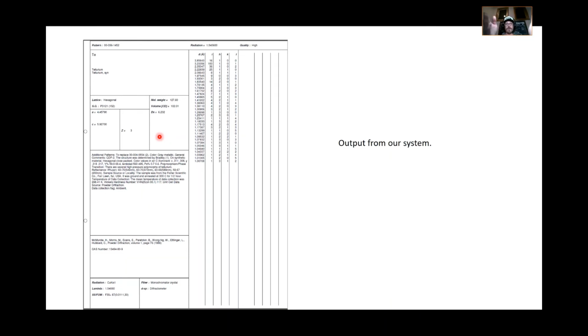And then you can also compare to different cards, so you can calculate your own d-spacing and see if your sample matches what's in the database. So spectroscopy, in a lot of ways, is comparing with lookup tables, or known data, to figure out what you have. And we'll see some examples of using known data to figure out what you may have in a little bit.